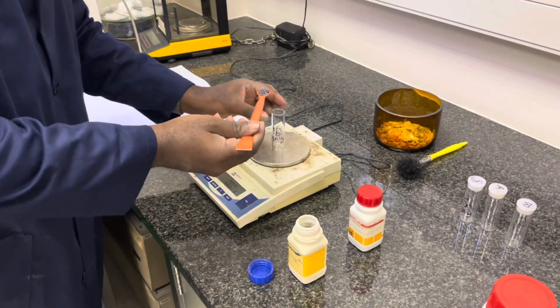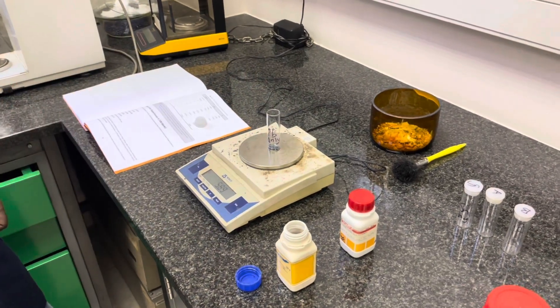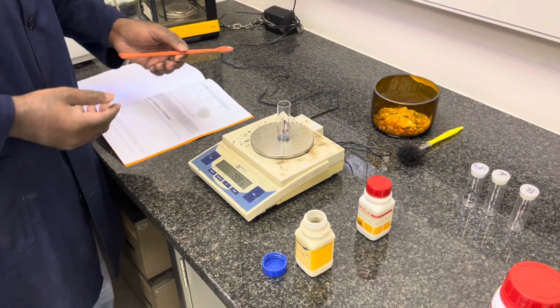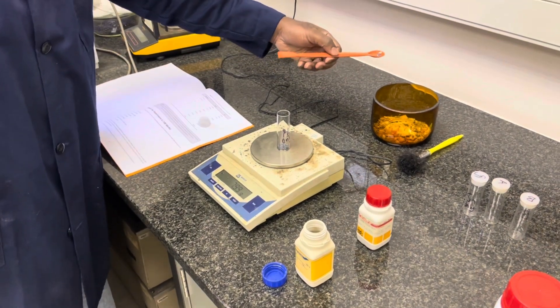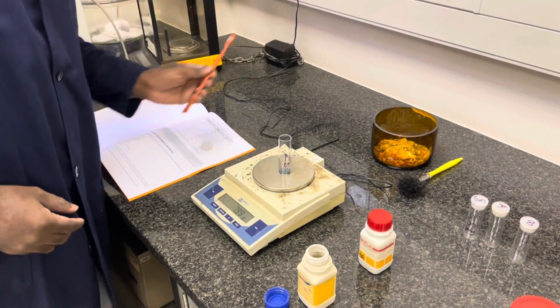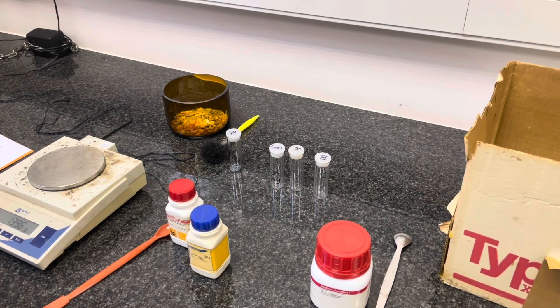Remember to have the scale tared, and ensure that if you have any spillage, you carry it over to the waste beaker located at the back of the weighing room. This then comprises our pure lead sample.